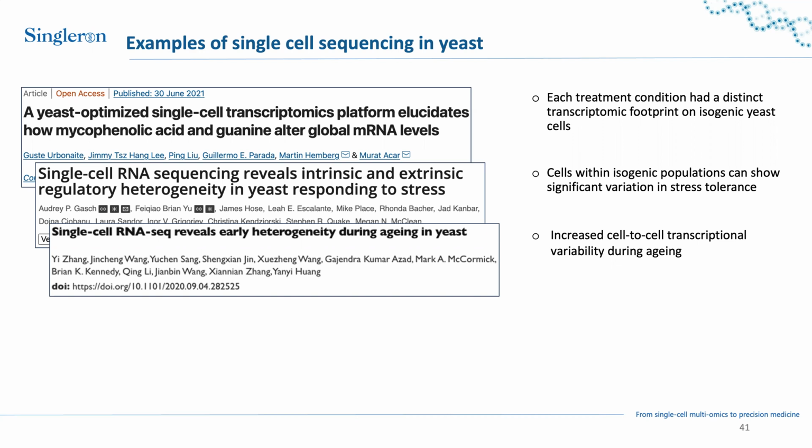And they were able to identify key biological processes that underlie aging in yeast. And they observed increased cell-to-cell transcriptional variability during aging.